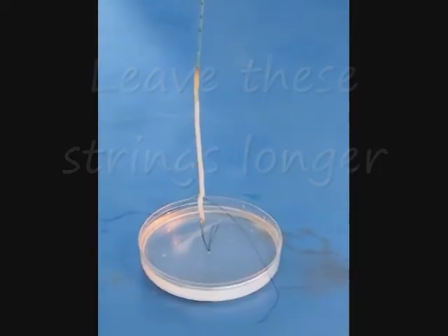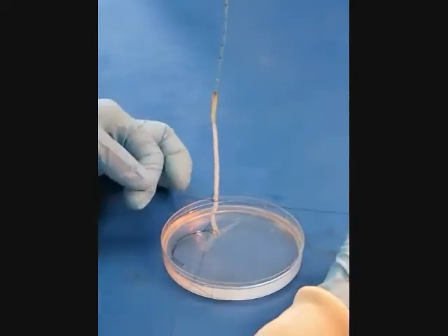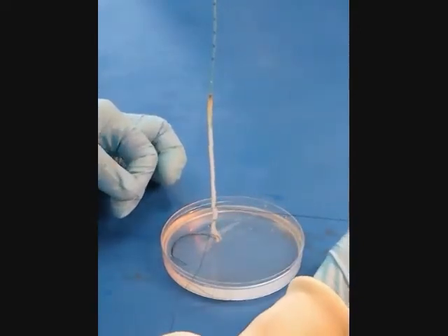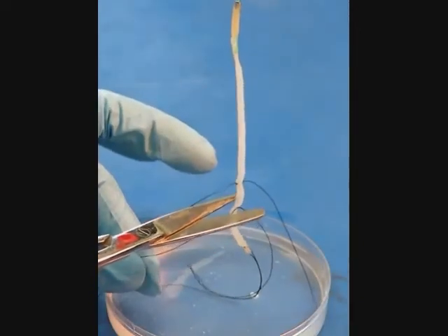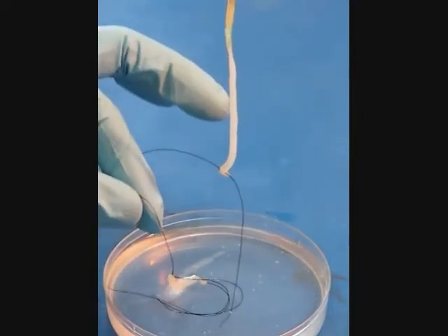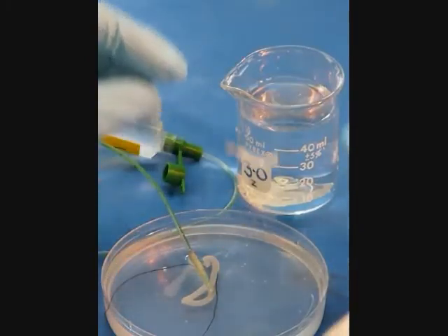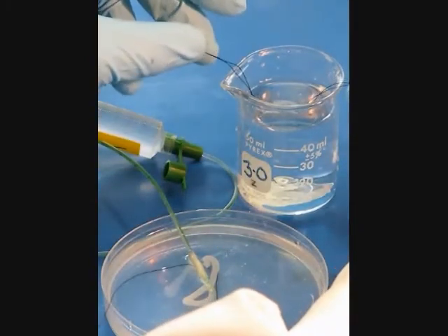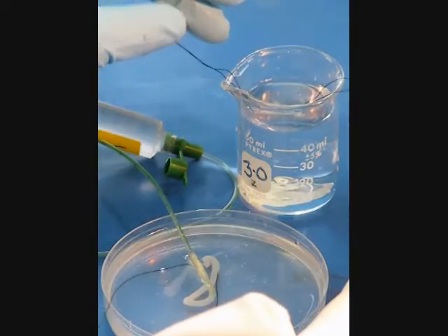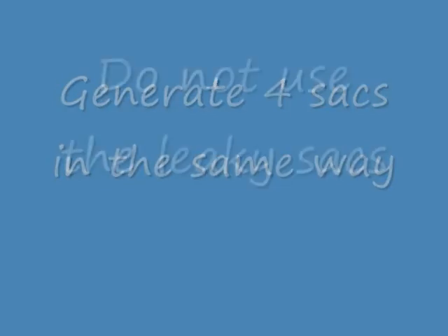Tie off the first segment about two centimeters above the first knot leaving some excess suture attached for handling. Tie another suture about half a centimeter above this. This will create some space between your first and second intestinal sacs. At this time you can cut the intestine between the two sacs and place the first sac into the appropriate beaker. Leave excess suture draped over the edge of the beaker. Continue this process up the length of the intestine placing each new sac immediately into the appropriate aerated beaker.